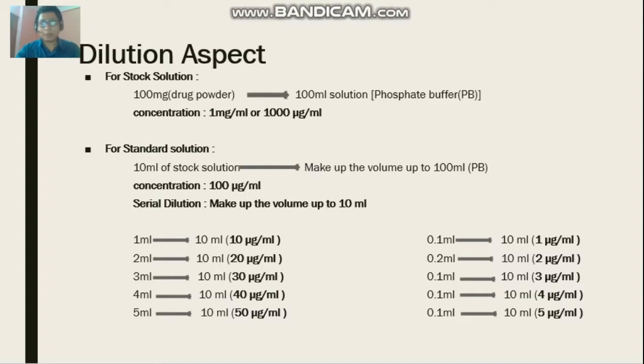After that we'll move forward to see how the UV visible spectrophotometric study can be performed.